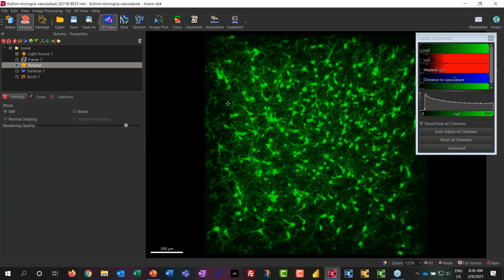All right, we have a lot of questions. There was one repeat because I was answering the questions during the live session, but there were more coming in towards the end. One question: we were mentioning the volume overlap. Is there also a way to measure the contact area of the surfaces?